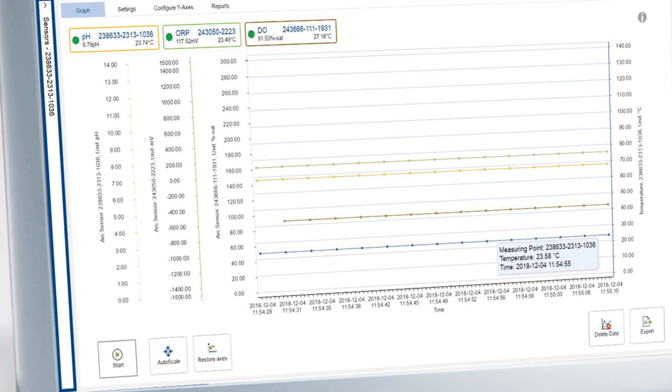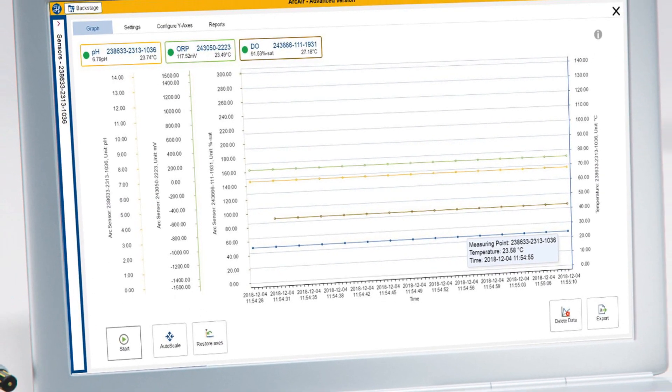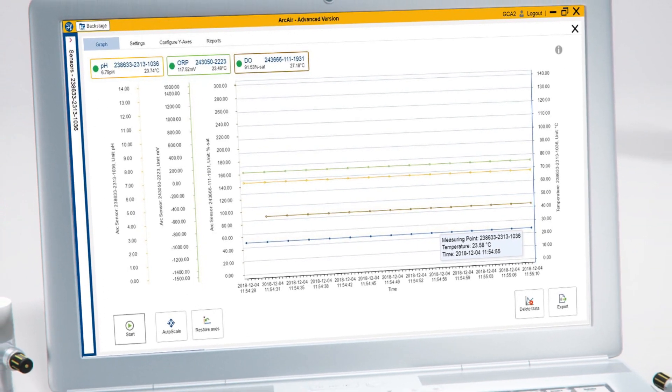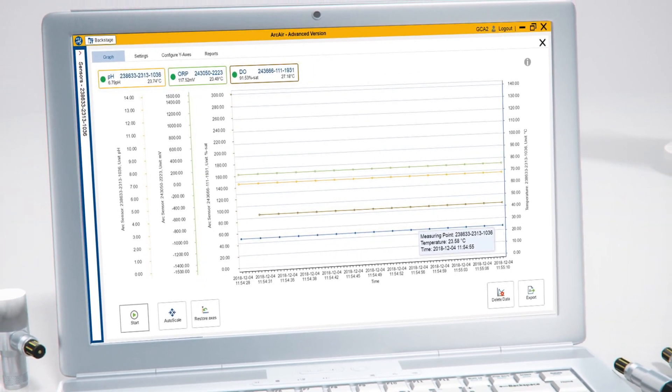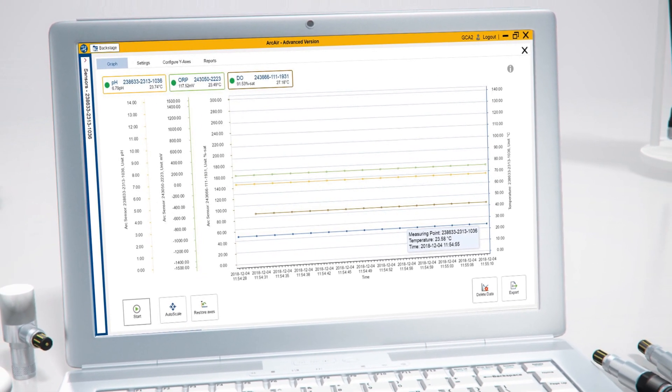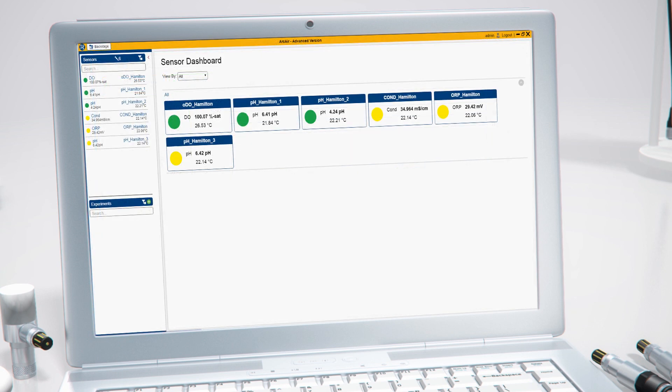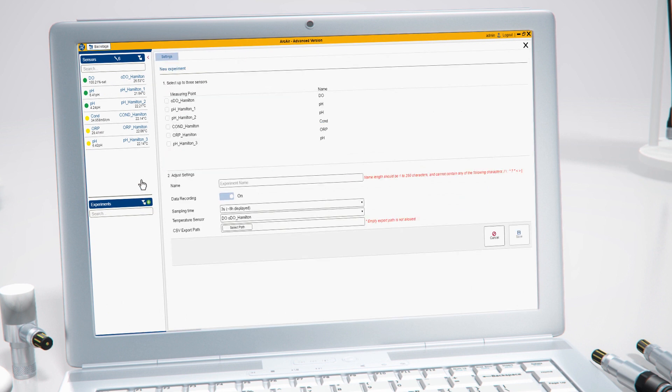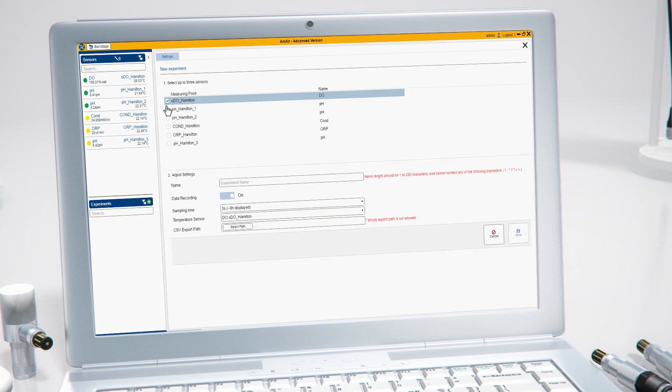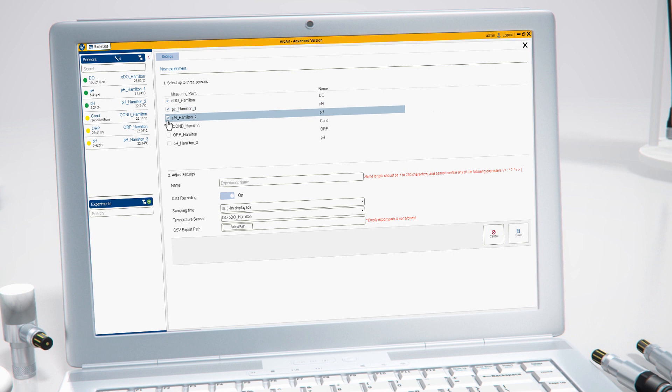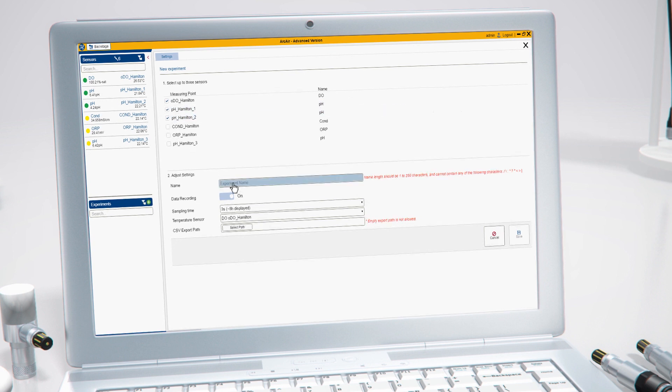The ArcAir app provides an easy way to record and display your measured data in a graph using the experiment feature. In order to record the measurements, you need to create a new experiment. Select up to three arc sensors for data recording and graphical analysis. Give your experiment a name and adjust the additional settings according to your requirements.